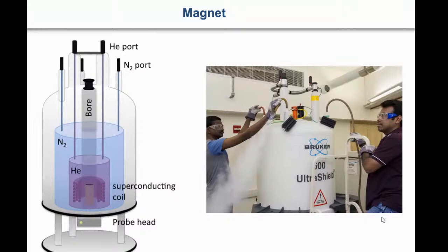Similarly, the liquid helium ports are on top. Here, so you have to fill up here. Your transfer line goes up here, okay, and then you have to open up this region here. You see that region, not these. These are pressure valves. Don't open those, okay? This region here. And don't start filling liquid helium here because I have gone through this seminar, okay? You should require some experience doing it. Because liquid helium, you have to do it carefully.